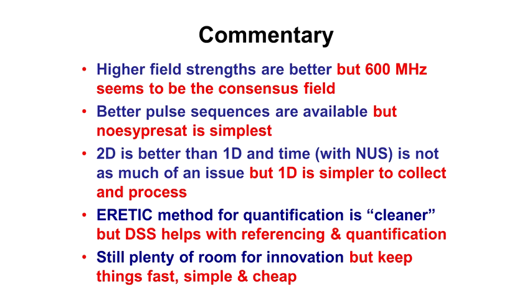If you're trying to come up with something that would improve the technology, it's always possible to come up with an amazing pulse sequence or amazing preparation protocols. But if they take 24 hours, no one's going to adopt them. So if you can keep things simple and fast and cheap, and always keep that in mind: can I make it simpler? Can I make it faster?